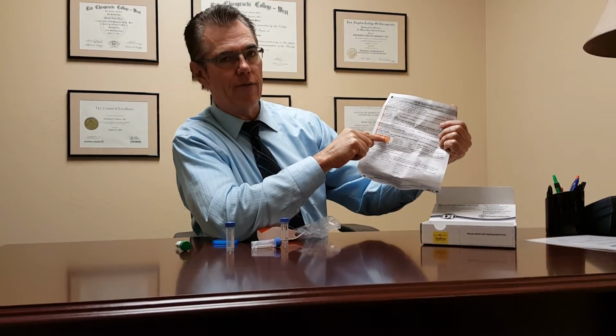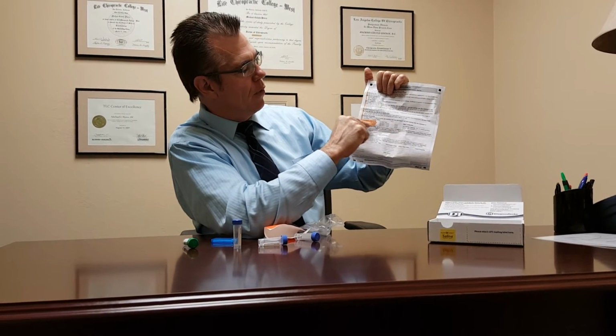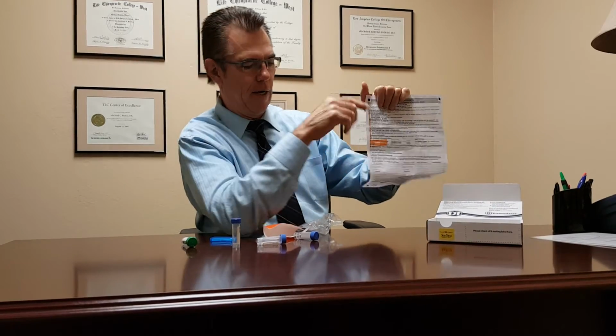And then the next collection time will be done at noon. That's basically 11 to 1 p.m. You will take the sample that's marked noon and repeat the same thing. Take another strip of the dental wax, chew it. This is a non-fasting sample here. However, there are some guides as far as, if you've eaten a meal or snack, to write the time that you've done that on there, on the paperwork.